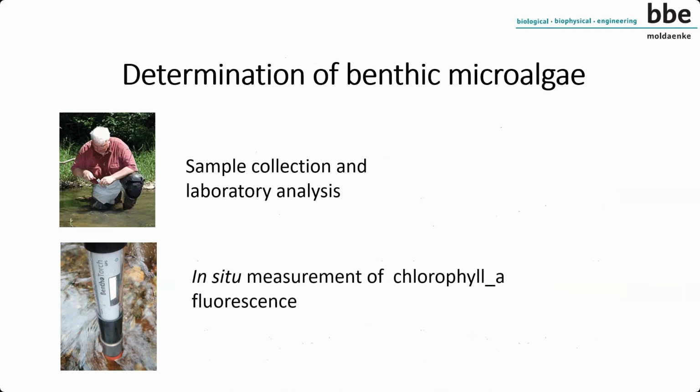And then in the laboratory, this was extracted with organic solvent and measured spectrophotometrically for the amount of chlorophyll A. Another method is also to resuspend these biofilms and fixate them with Lugol's solution, which means that we can determine under the microscope which kind of algae you can find inside of it.